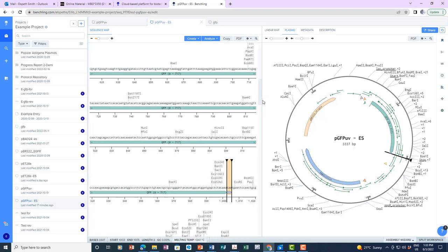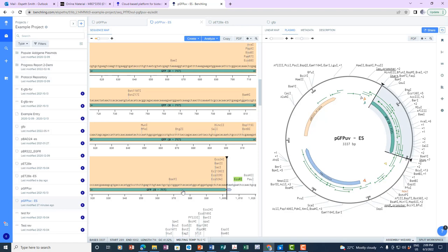So we're gonna be using NdeI and EcoRI to clone into the pET28a plasmid. So we need to make sure that our amplified sequence also has these restriction sequences flanking the coding region. Now, when we selected these restriction enzymes, we had to consider several factors. So the first one is we needed to make sure we were selecting restriction sequences that were not already present within the coding region of the gene we want to amplify and clone. Because of course, after amplification, we're going to be digesting our PCR product in order to later ligate it into the pET28a plasmid, and we don't want to end up cutting our product in half.